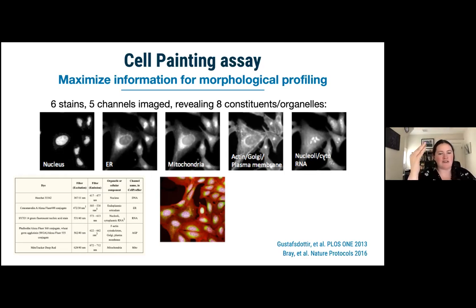Now I'm going to delete all the dots of size 2 and 3 and 4 and so forth. And so that measurement, even though you're not identifying things as objects, gives you a really good measurement of how many lysosomes or endosomes or whatever of sizes 2, 3, 4, et cetera, are present in your image. And we're able to get things like suborganelle size from those kinds of measurements.